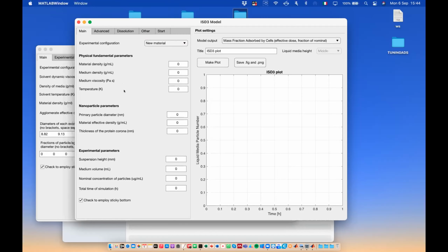If you're interested, Hermes can certainly give you an overview of how they work. Those are the DG and the Isd3, two published models incorporated in the GUI, so that users can easily and flexibly apply them to their experiments.